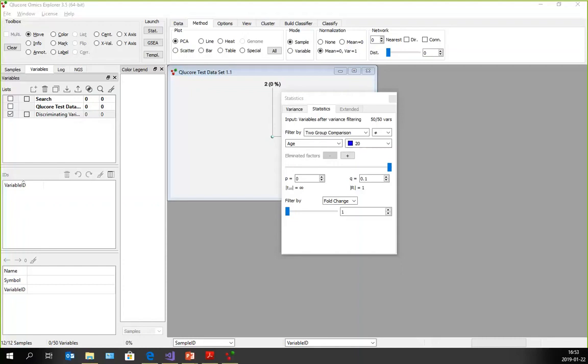If you try this out, if you have any questions or any support issues or want to report something about templates, please contact our support email. And I should say also that many features of Omics Explorer, but not all, are available in templates now. So you can control most things, but some things are still not there. If you run into something you need for what you are developing, or if you want help on how to get started or to do something in templates, don't be afraid to just send us an email at support@qlucore.com, because we'll help you out if you want to do this yourselves.